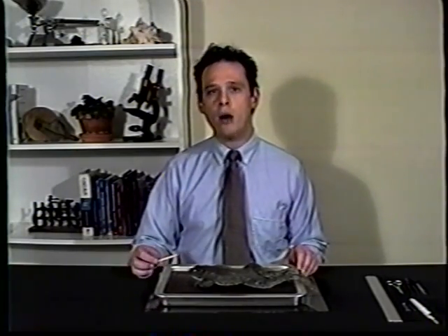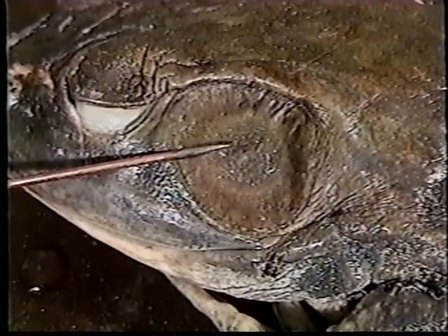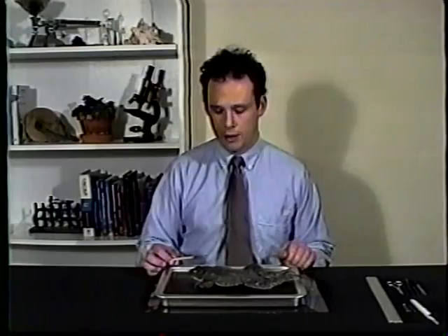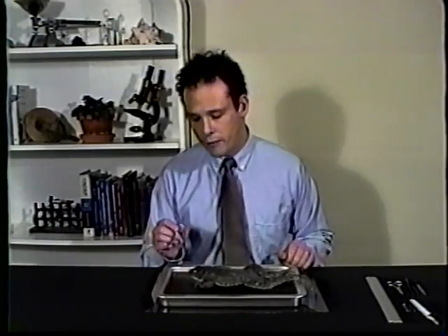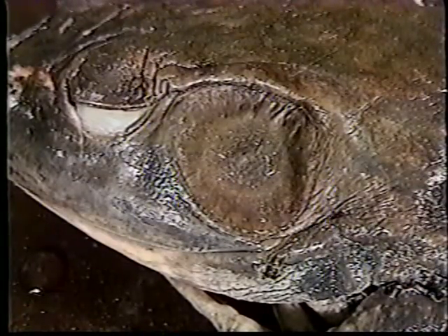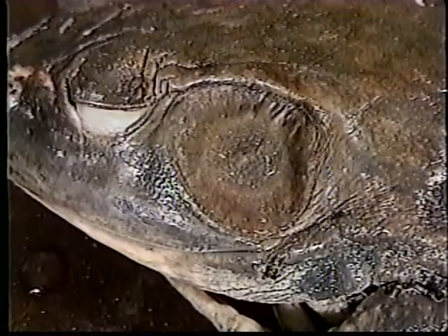Now let's examine the ears of our specimen. A frog's eardrums are actually located on the outside of its body, unlike you and I, who have eardrums that are located inside of our head. The eardrums pick up sound vibrations that pass by the frog. These messages are sent down a very fine, thin canal. Nerves pick up the messages from there and communicate them to the brain. This all happens very fast and allows the frog to act on stimulus from the environment.